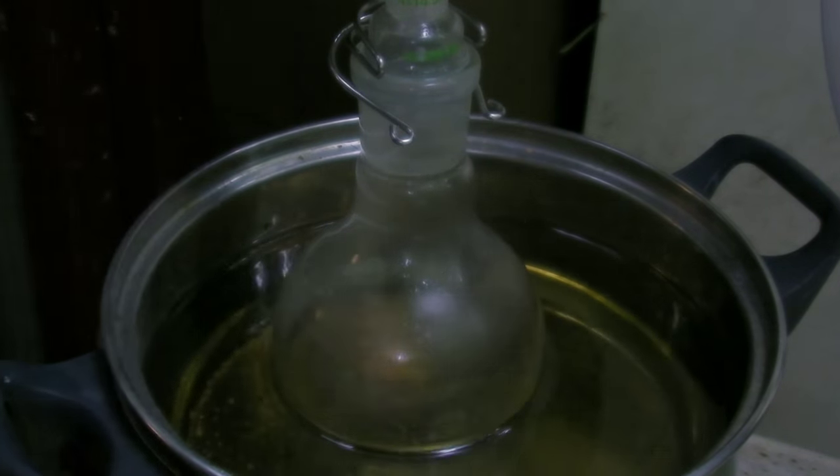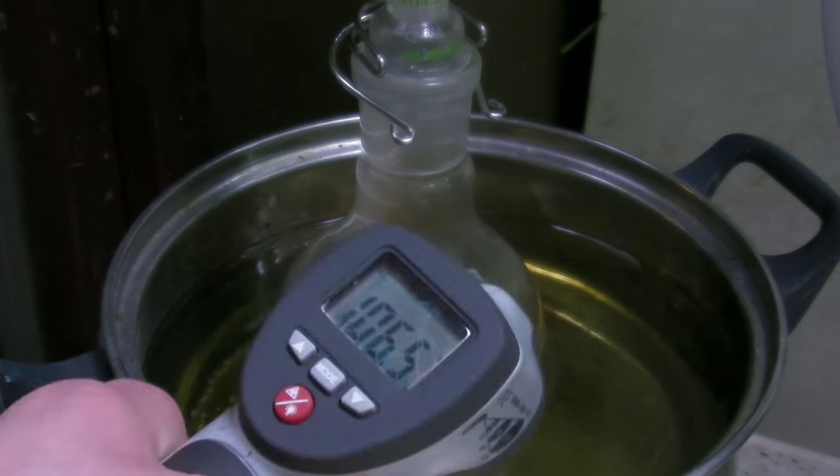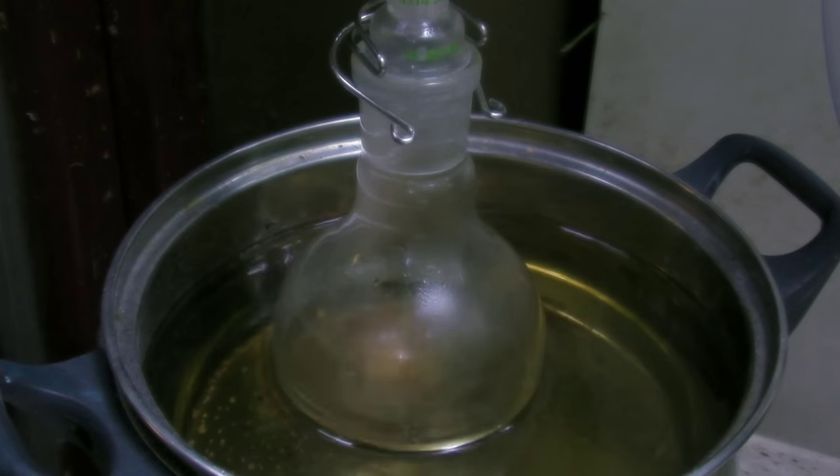The low pressure reduces the boiling point of the substance. For example, substances which would decompose before reaching their boiling point can be distilled with this method.